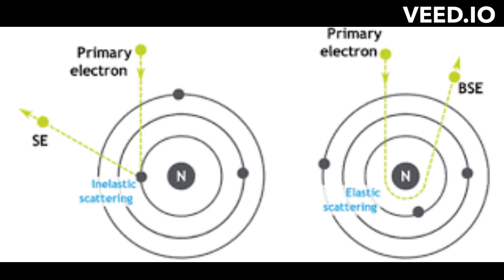Backscattered electrons come from deeper regions of the sample, whereas secondary electrons originate from surface regions. Thus, the two carry different types of information. Backscattered electron images show high sensitivity due to the differences in atomic number. The higher the atomic number, the brighter the material appears in the image. Secondary imaging can provide more detailed surface information.